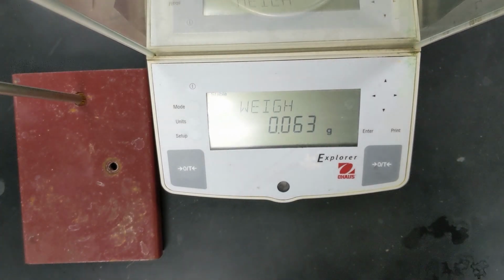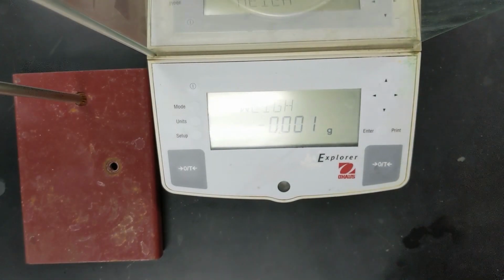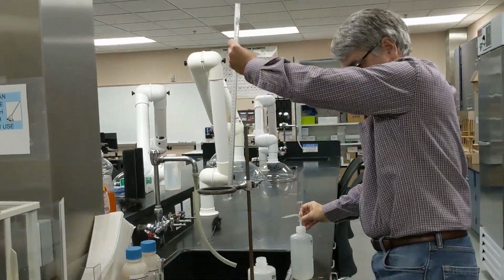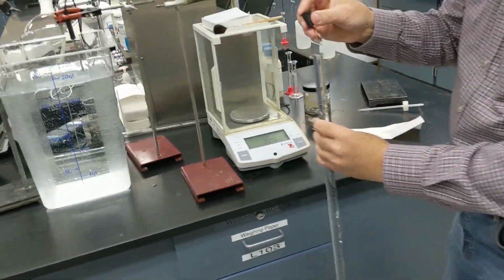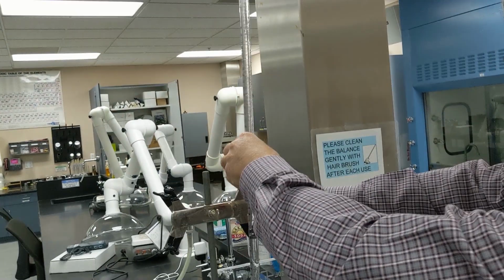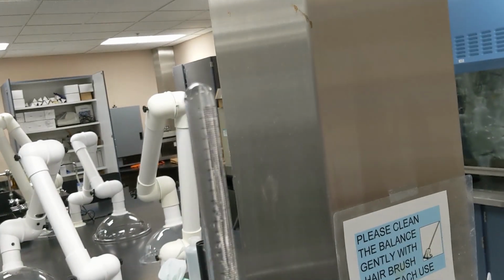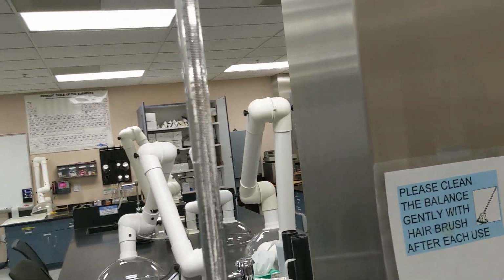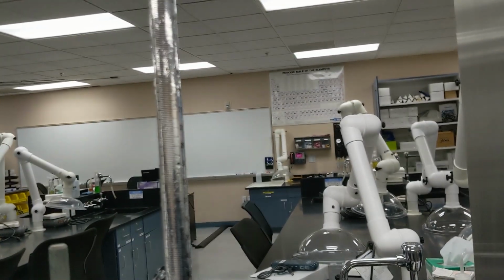Okay, so here's trial 2. I've put the magnesium on the balance so we can look at the mass. And let's put that onto our copper wire. 8.5 mL of concentrated hydrochloric acid. Now we're going to fill up with distilled water. So notice that our initial volume is 0. You can see the eudiometer is completely full. And again, we can see the mixing of the different liquids, the concentrated hydrochloric acid mixing with water.